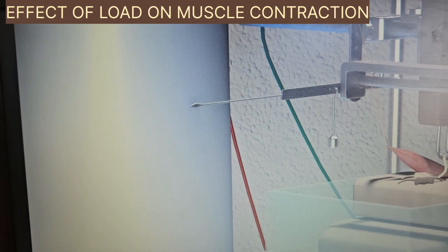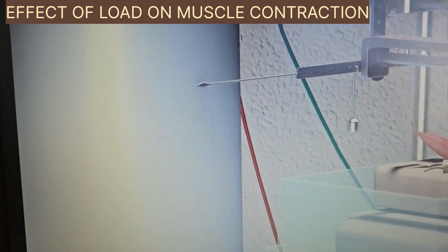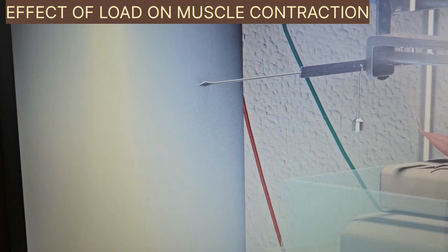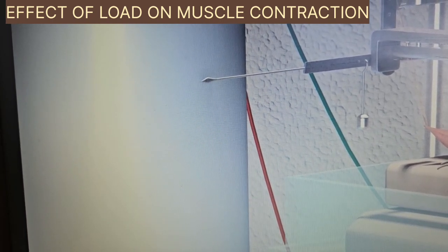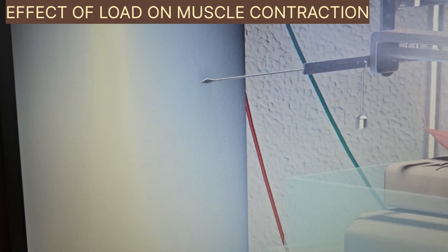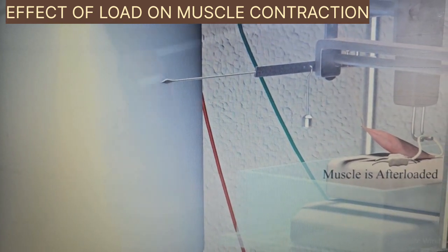When the screw is in this position, the load does not act on the muscle when it is relaxed. The weight acts on the muscle only after the muscle contracts, that is, shortens. In this position, the muscle is said to be afterloaded.